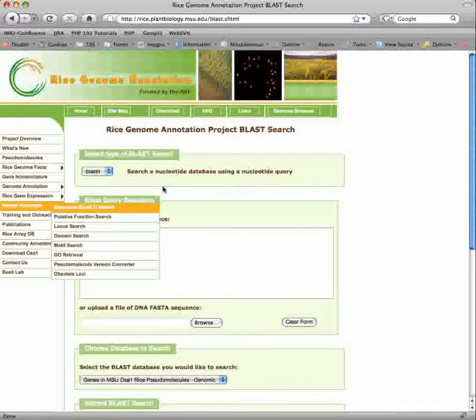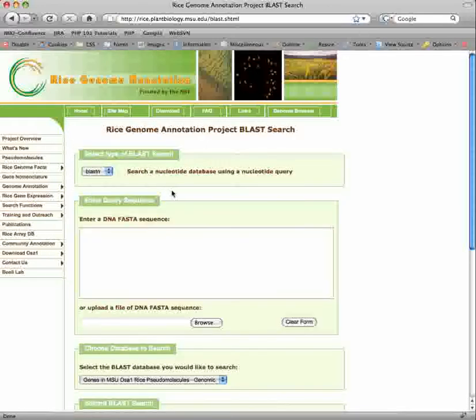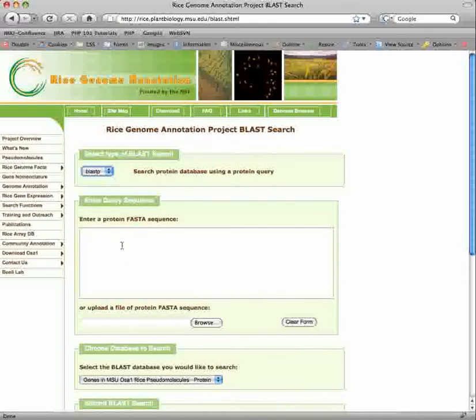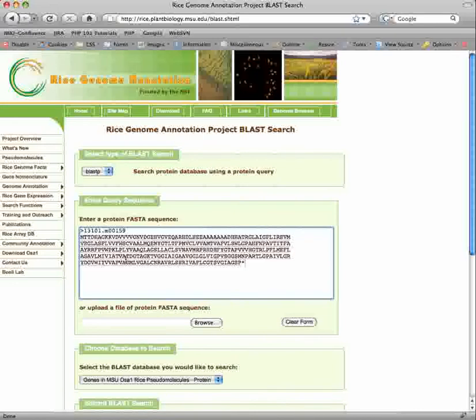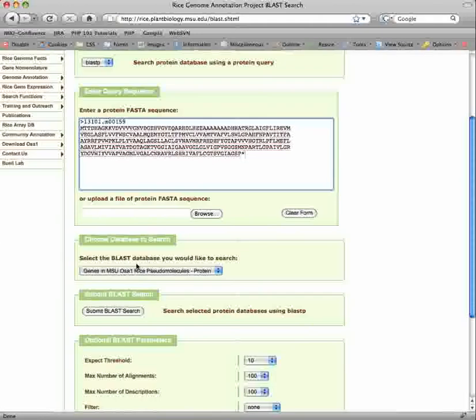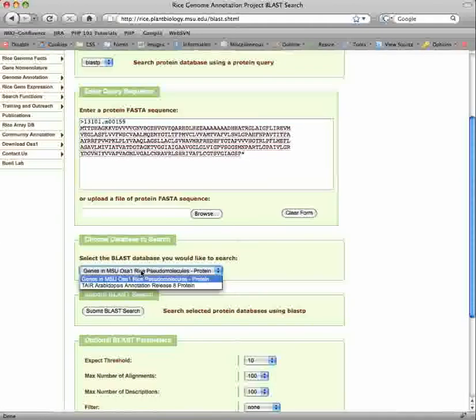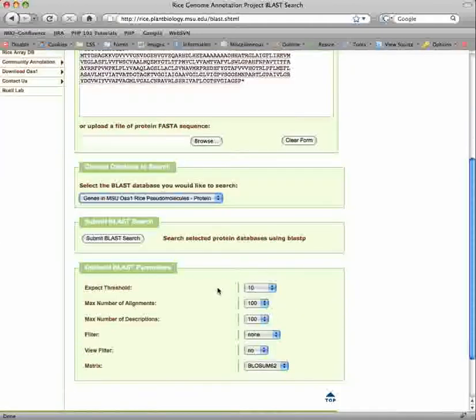On the BLAST page, you can perform searches of 27 different databases. Select the type of BLAST search you wish to do, and enter your sequence in FASTA format, or upload the sequence from a file. Choose the database you wish to search, and modify any search parameters as needed.